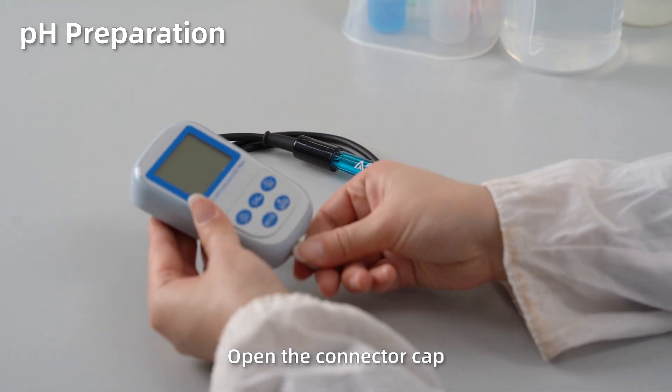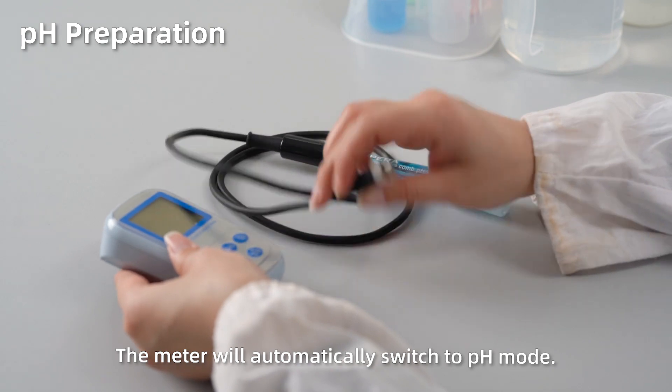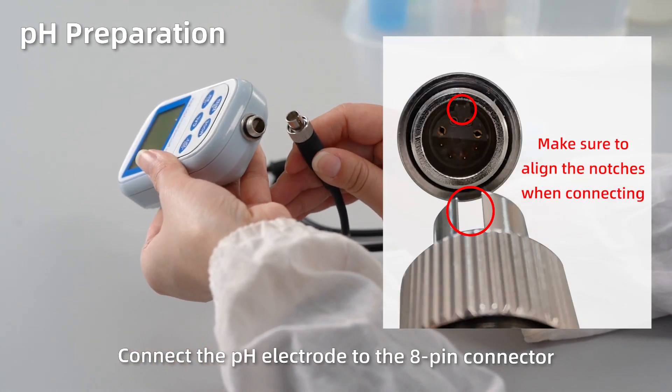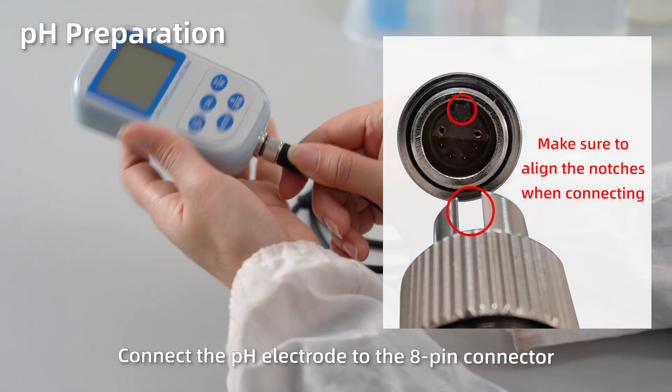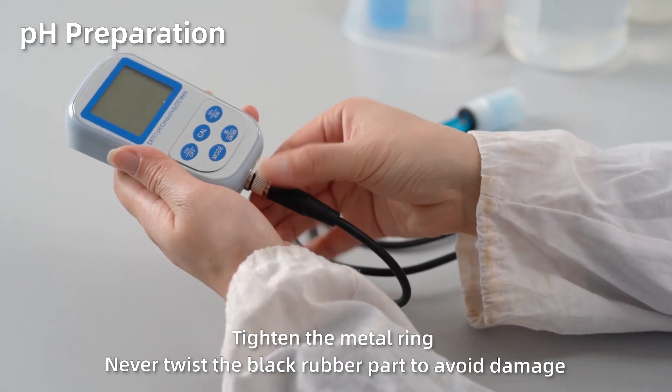pH preparation. Open up the connector protection cap — the meter will automatically switch to pH mode. Connect the pH electrode to the 8-pin connector. Tighten the metal ring. Never twist the black rubber part to avoid damage.